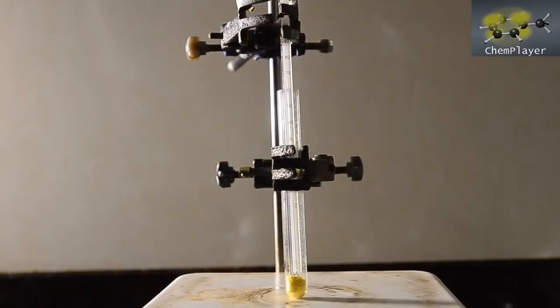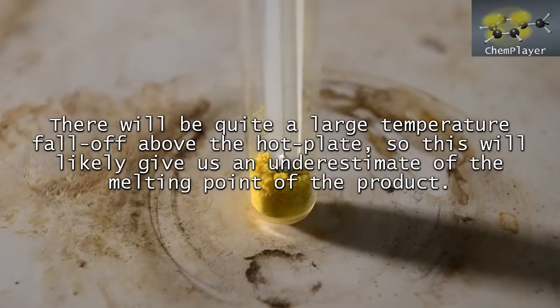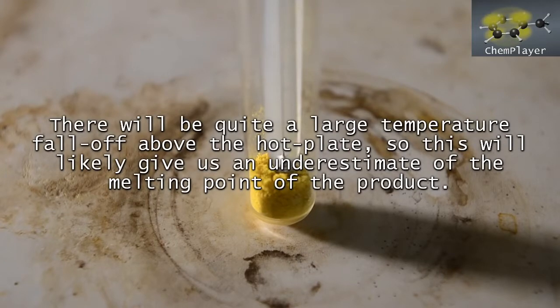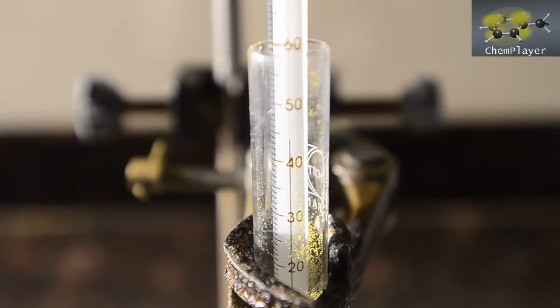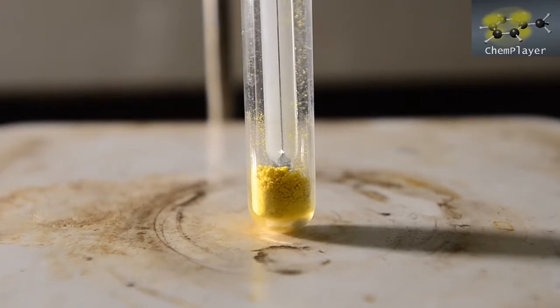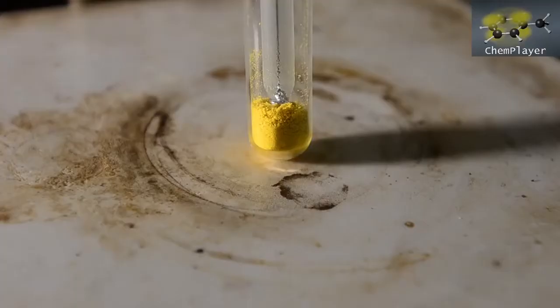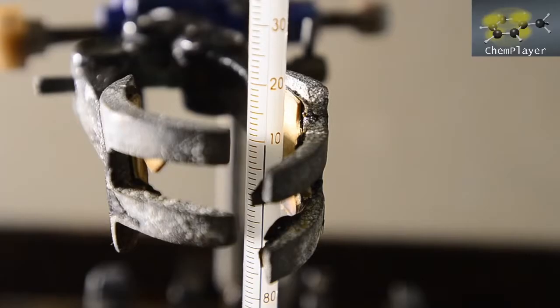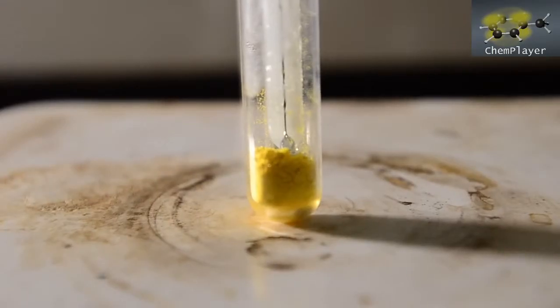We've rigged up a slightly dodgy melting point apparatus using a hot plate, a test tube sitting on it, and a thermometer inside the test tube to record the temperature. It's not going to be totally accurate, but it will give us an indicator. We've got the heat on and the temperature is slowly rising. We'll watch this closely to see if there's any signs of the product melting. (110°C). Still no sign of melting, so it's definitely not vanillin.